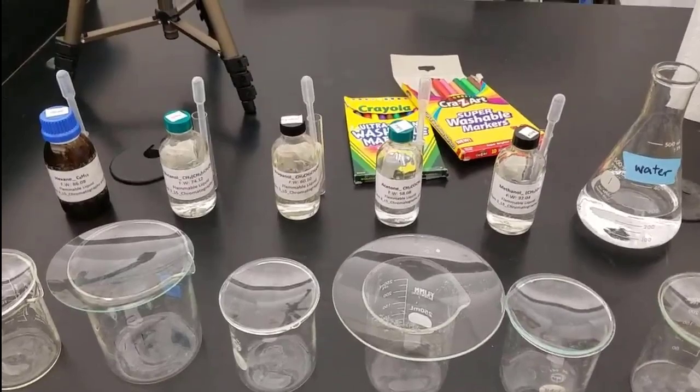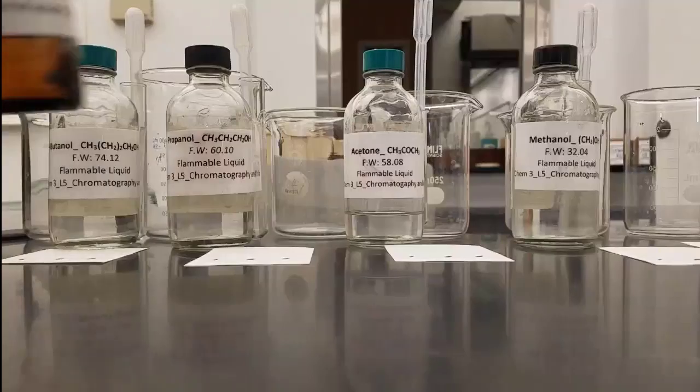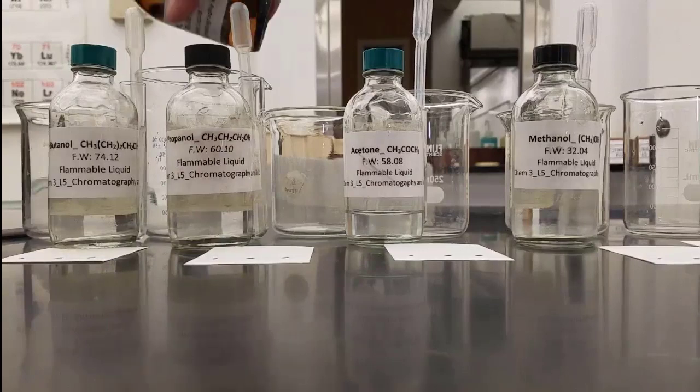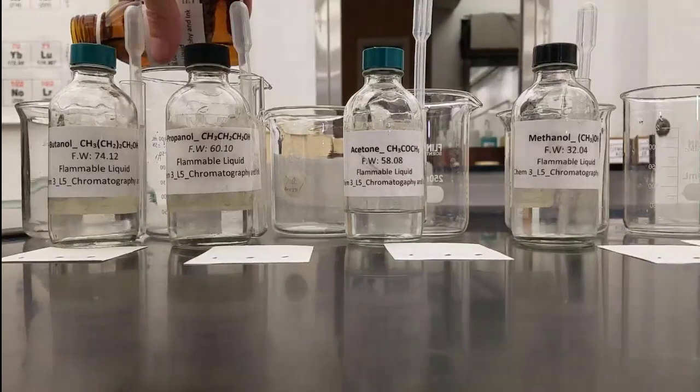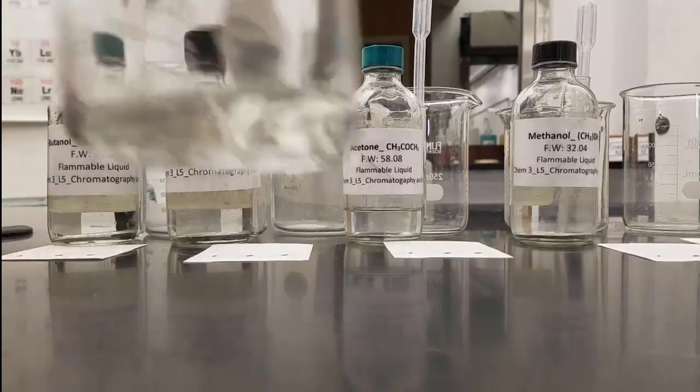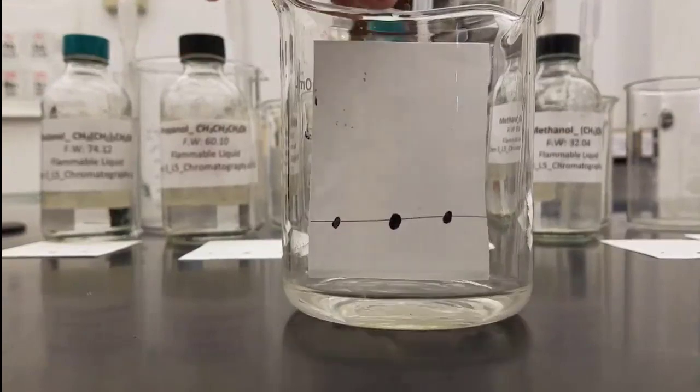Each beaker is going to contain a different solvent, so each of the papers will be prepared with three spots as you just saw. The first beaker will contain hexane. We pour about a centimeter, centimeter and a half of hexane into the beaker, just enough to cover the bottom of the paper because it's going to get soaked up by the paper.